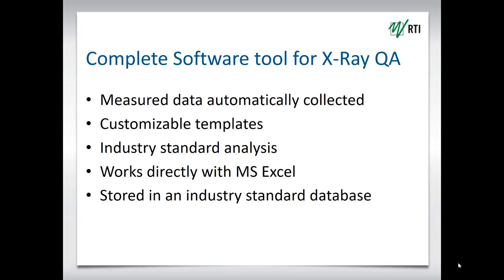All of your data is saved and stored in Ocean's industry standard database. Finally, Ocean can produce customized reports in hard copy or soft copy like PDFs for the facility you work at or for some other facility that you support, giving your results a customizable professional appearance.